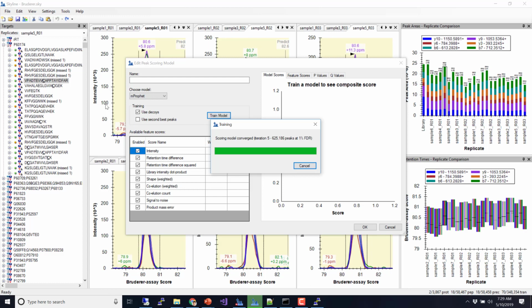It then is finished, and it's going to populate this with a bunch of data. And it's going to have a finished model. Right now, it's probably calculating the weights, which are probably already calculated. It's going to give us these percent values, which it has to do and analyze the variance in the values for.